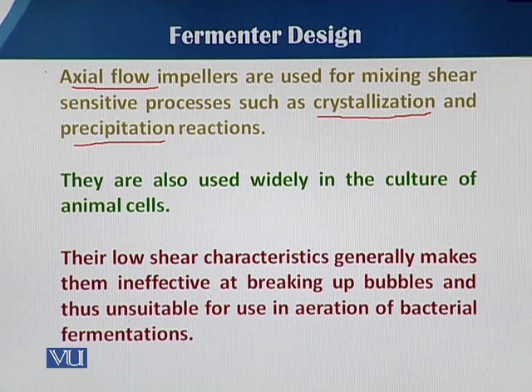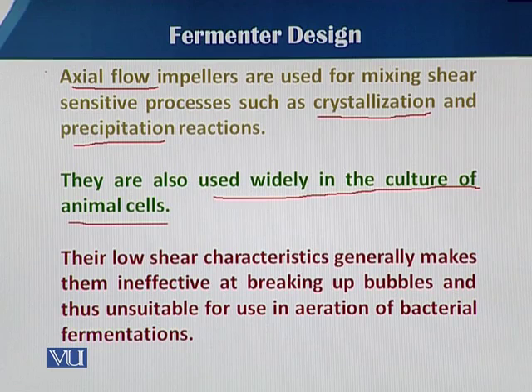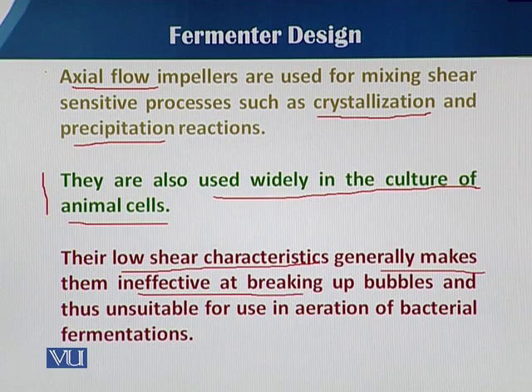They are widely used when we culture animal cells. When we use the fermentation process to culture animal cells, there is a need to use axial flow impellers. The low shear characteristics generally make axial flow impellers ineffective at breaking up bubbles.